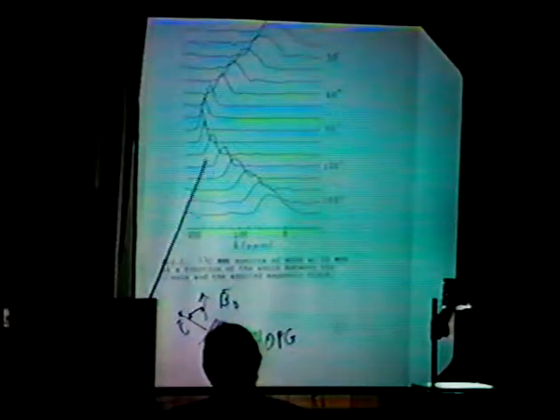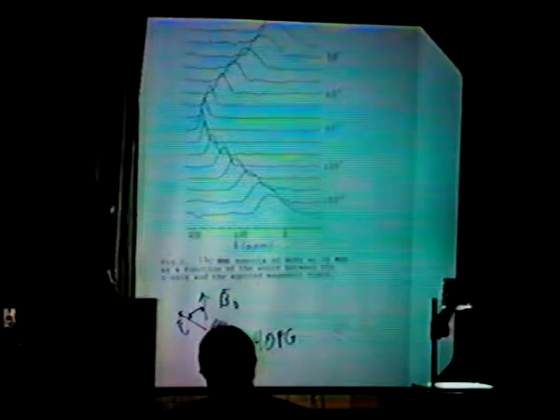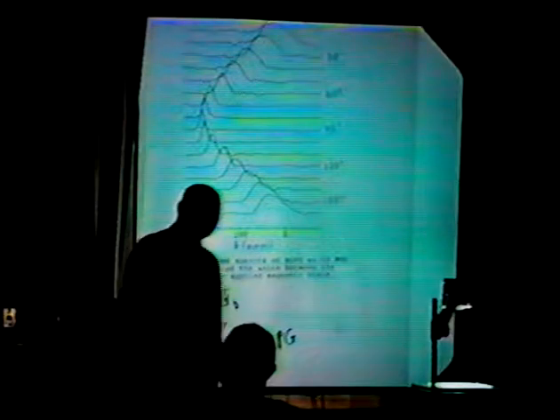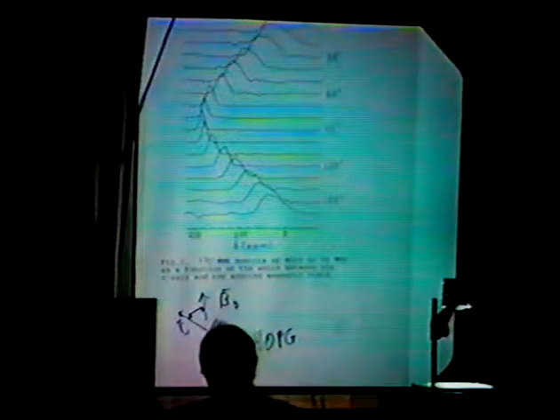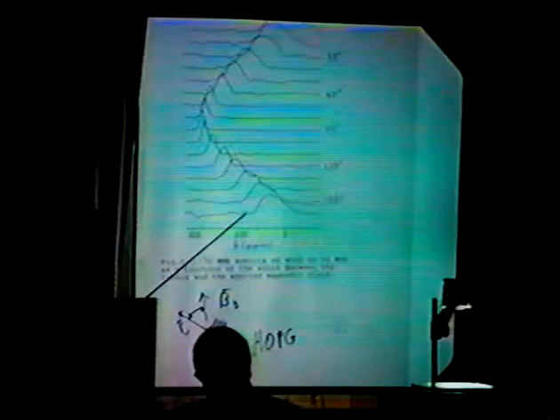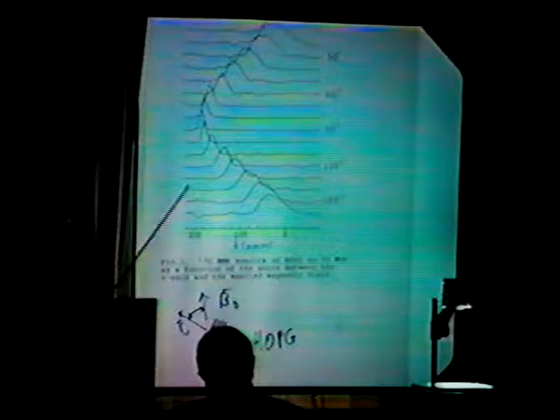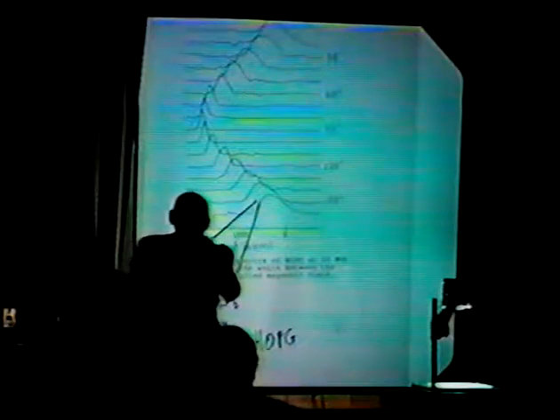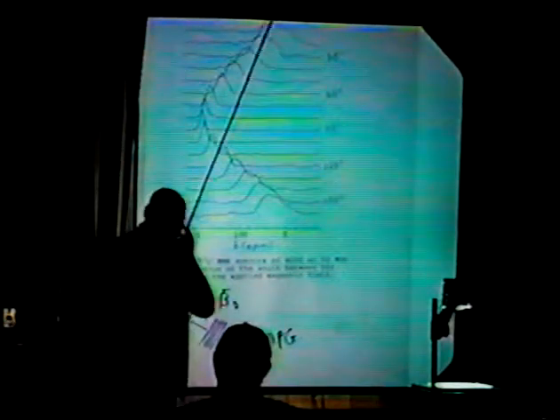For those of you who may have done nuclear magnetic resonance spectroscopy in liquids, and even those who have done magic angle spinning in solids, you will say, gee, these lines are horribly broad. If you do a spectrum for a well-crystallized solid, you expect these lines to be very sharp. So one of the things we're going to inquire into is why these lines should be as broad as they are.